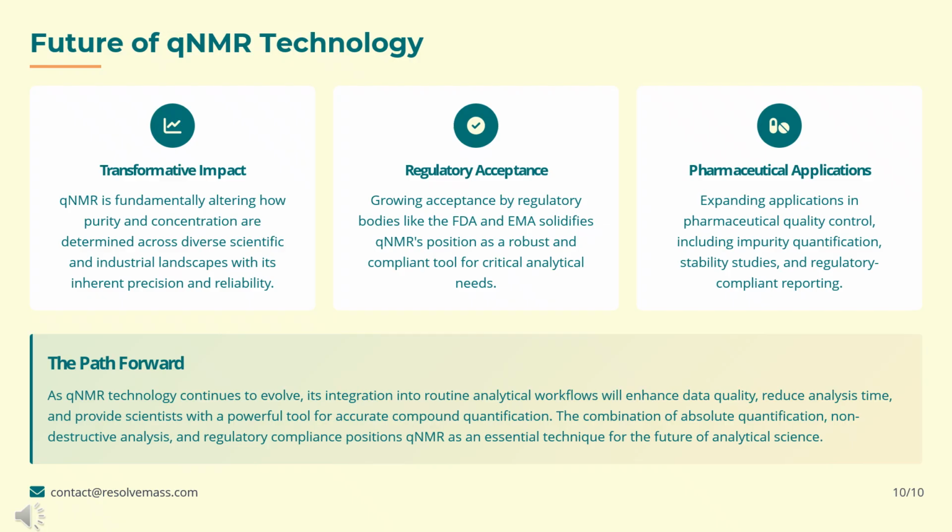The combination of absolute quantification, non-destructive analysis, and regulatory compliance positions qNMR as a cornerstone of modern analytical workflows. As technology evolves, we can expect faster analysis, higher data quality, and even broader adoption across industries.